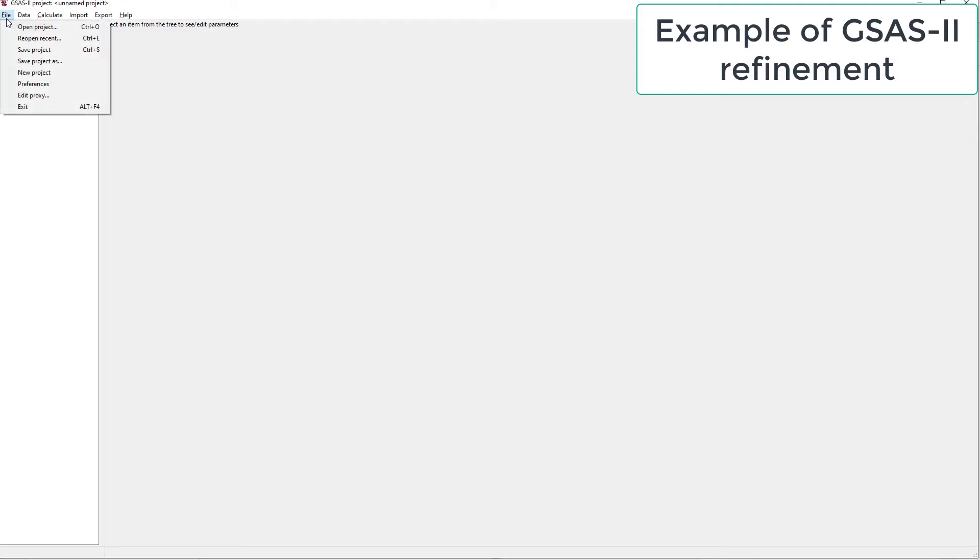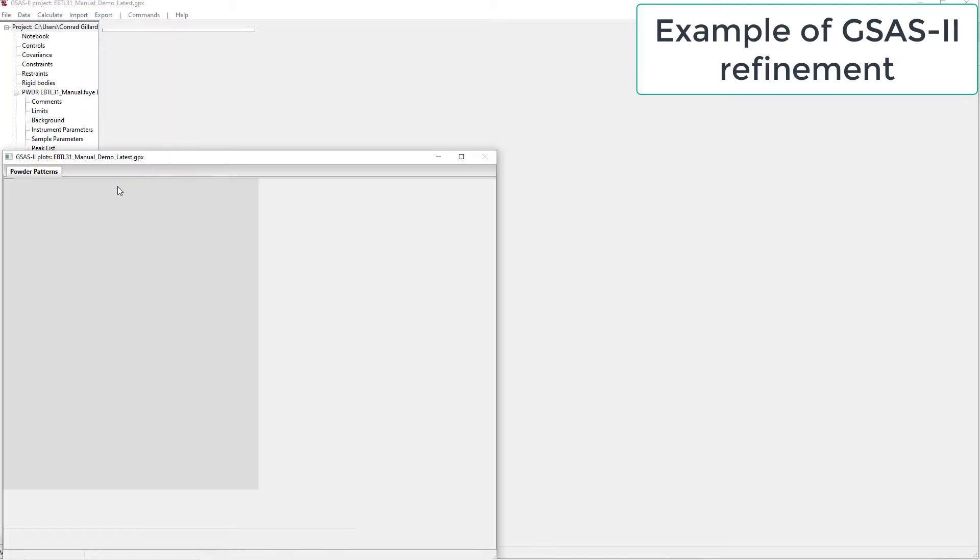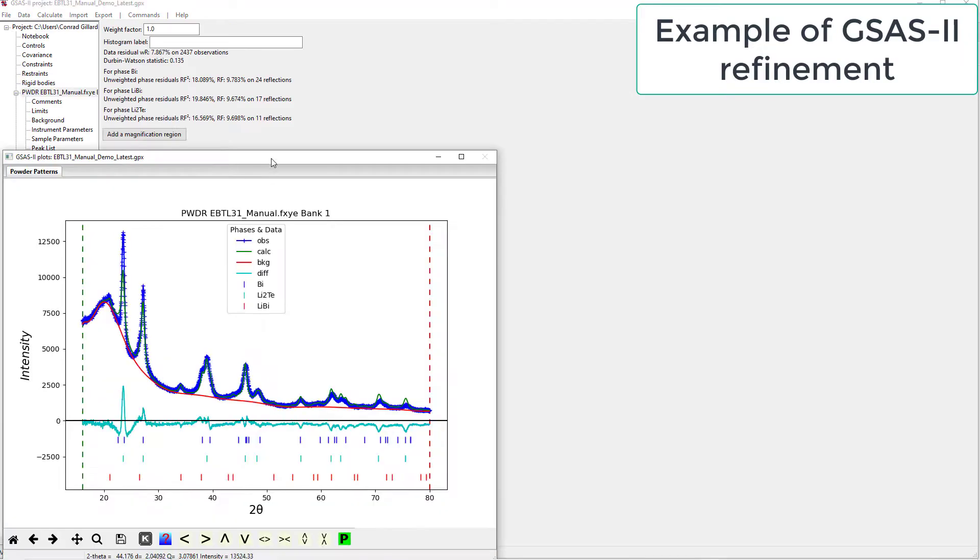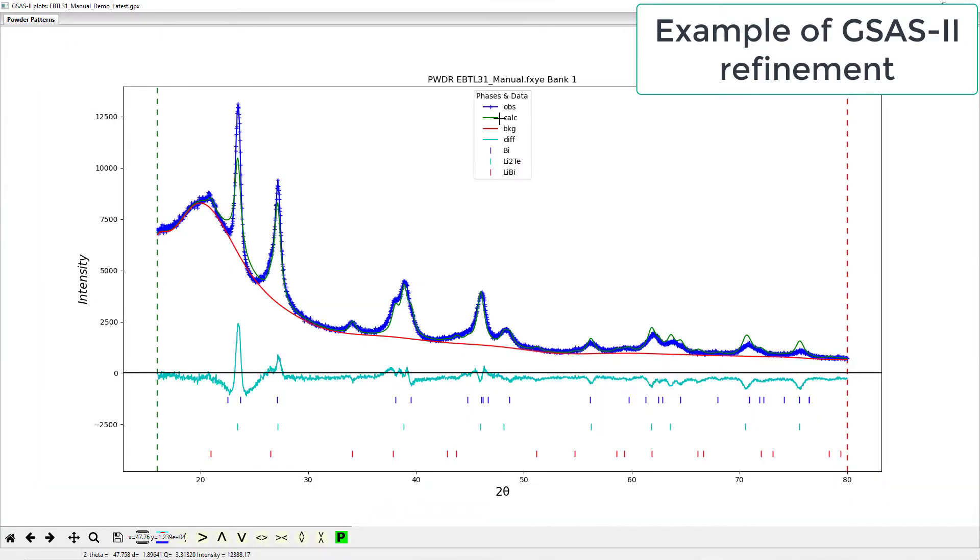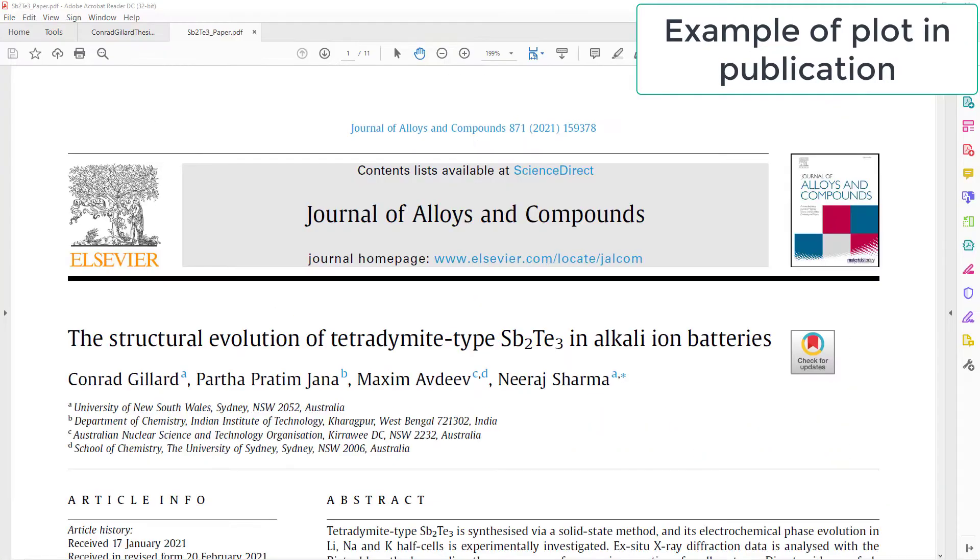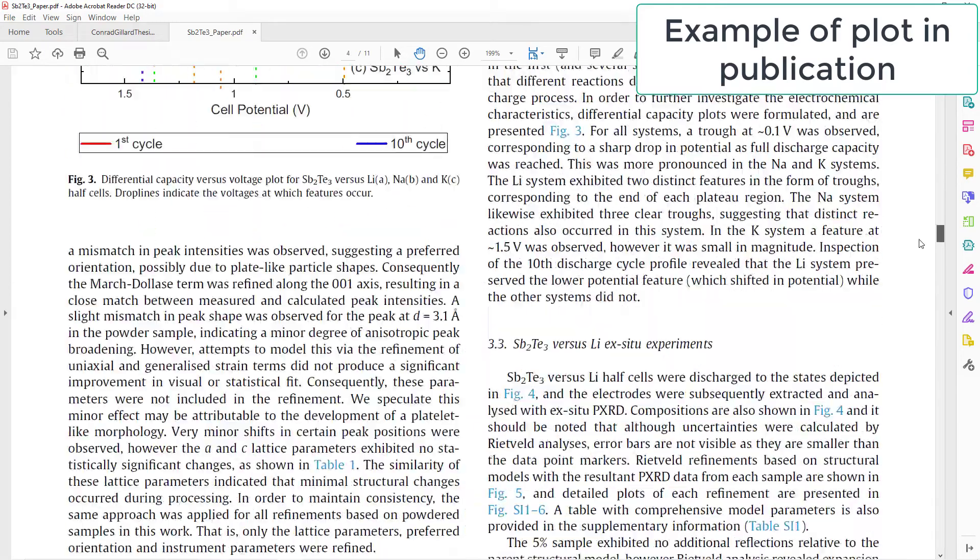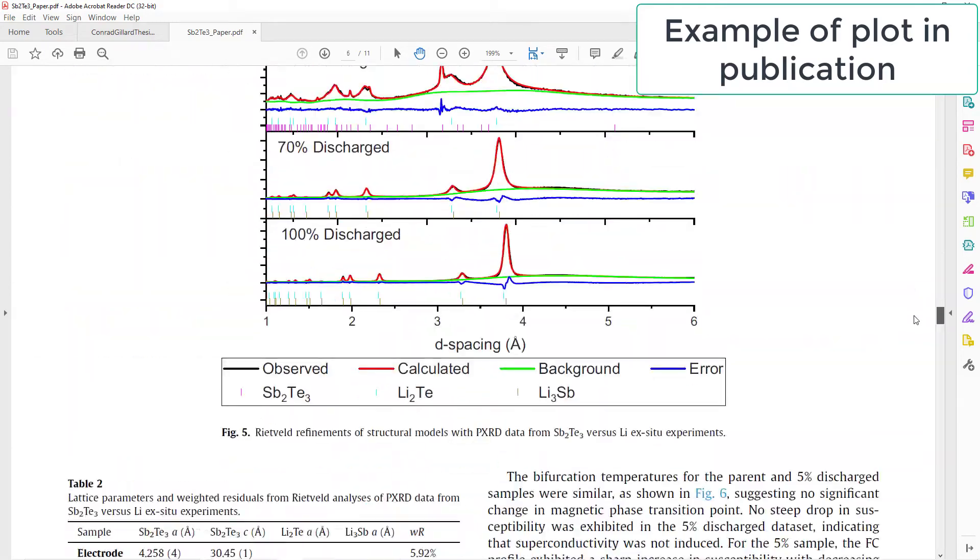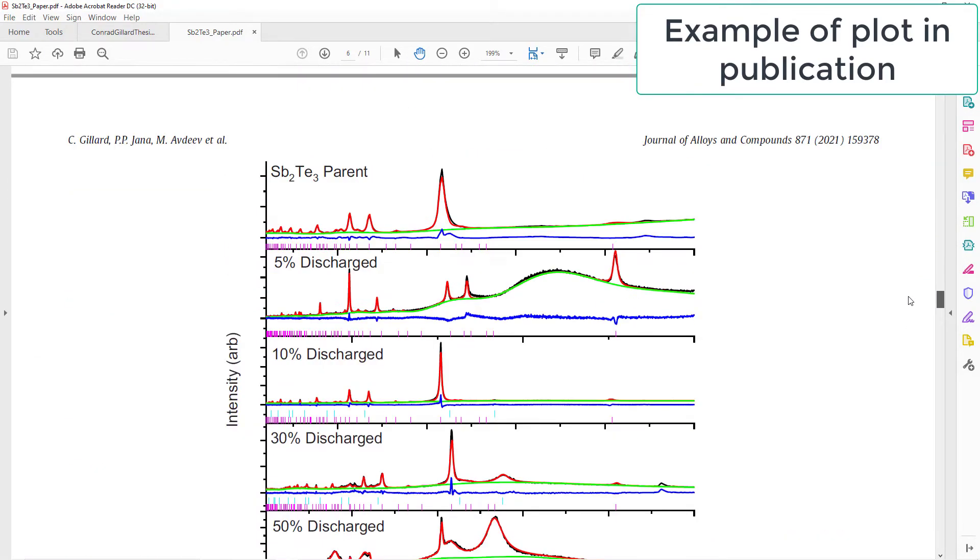Exporting plots of Rietveld refinements from GSAS2 to Origin was previously accomplished using a macro that I developed. However, this was still slightly inconvenient and had opportunities for errors to occur.